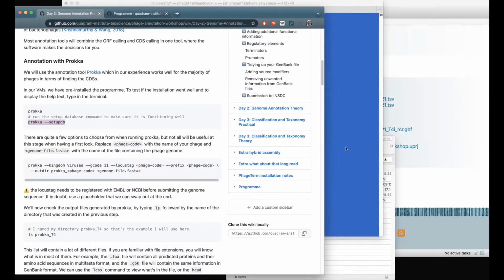If you use the bacterial database, I'm actually not sure whether they would be annotated or not. That's something that you can trial and error. It runs quite quickly, so you can just do both and compare. Okay, thanks.